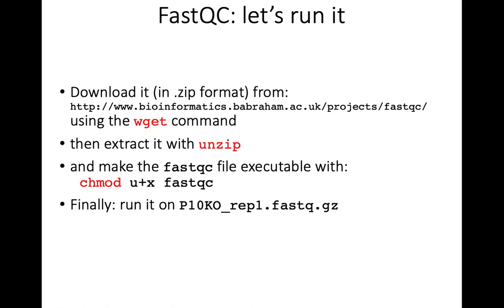Can you copy that again? If you copy to the... try Control-Shift. It's actually something with your terminal window rather than anything you're doing with the command line. It's something with the window.